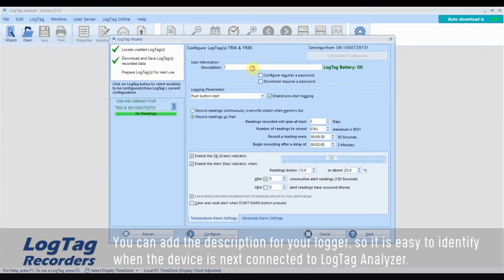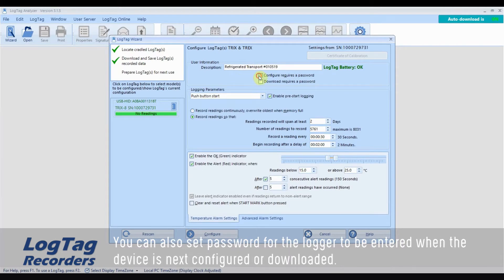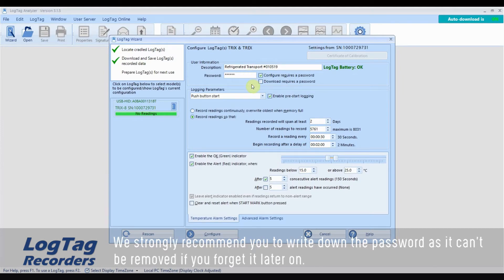You can add a description for your logger, so it is easy to identify when the device is next connected to LogTag analyzer. You can also set a password for the logger to be entered when the device is next configured or downloaded. We strongly recommend you write down the password as it can't be removed if you forget it later on.